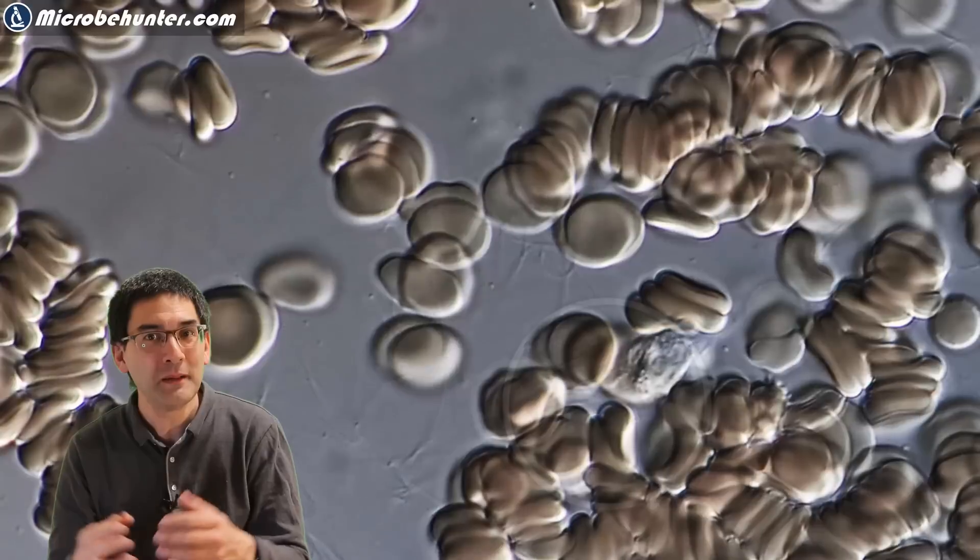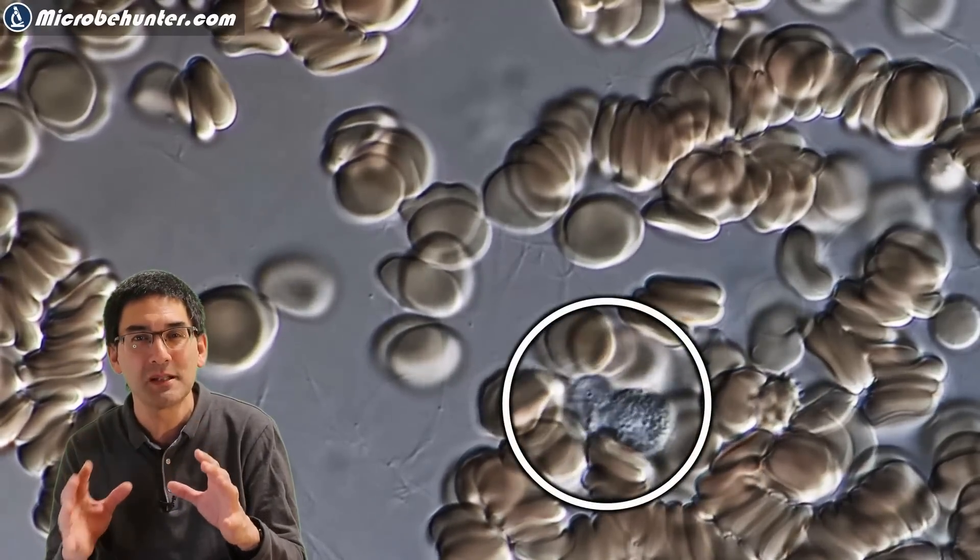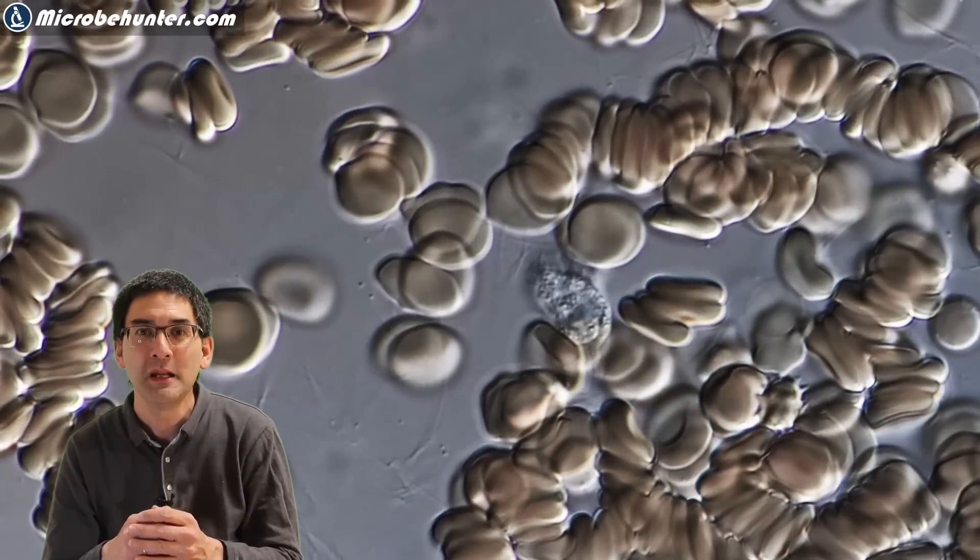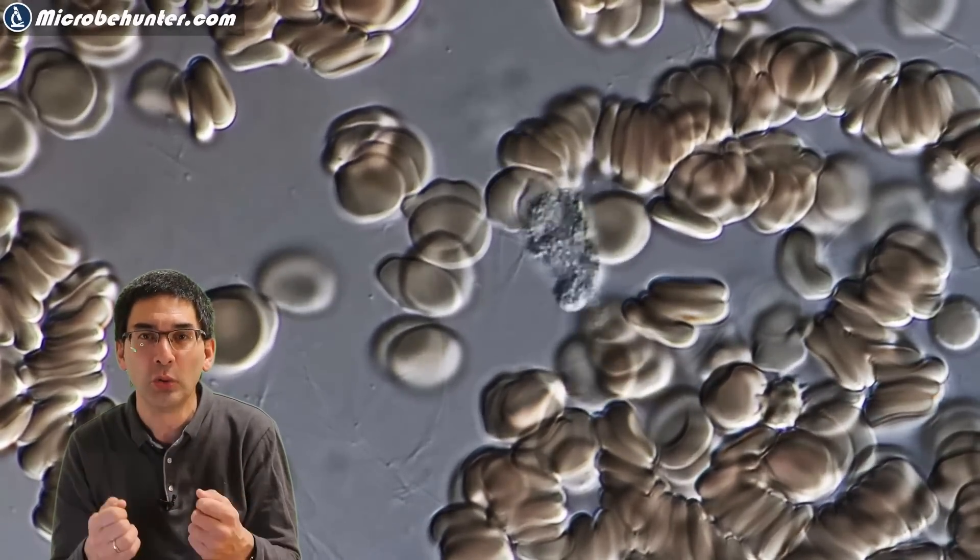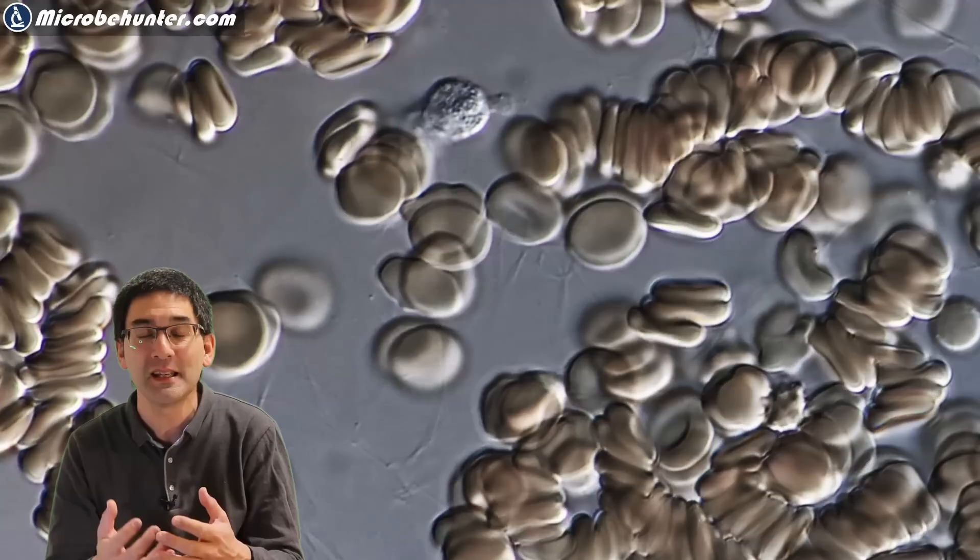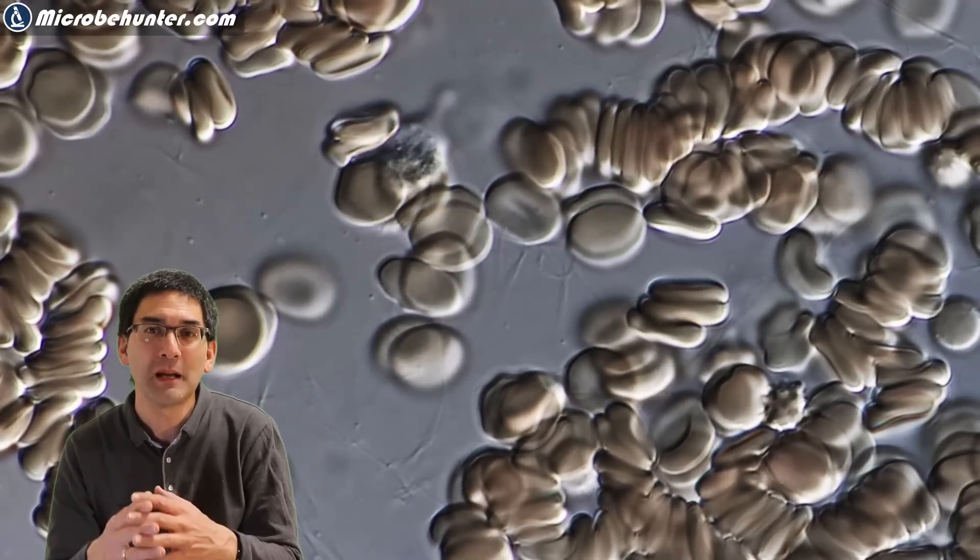When you look at the slide under the microscope, sometimes the red blood cells do cover them up a little bit, so they can be difficult to see. Also because they move so slowly, it can be difficult to identify them.